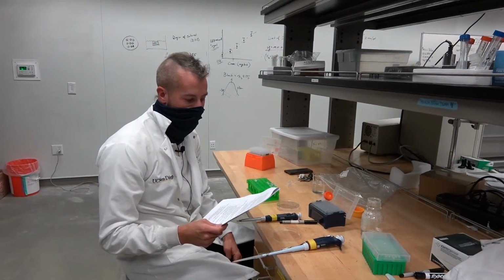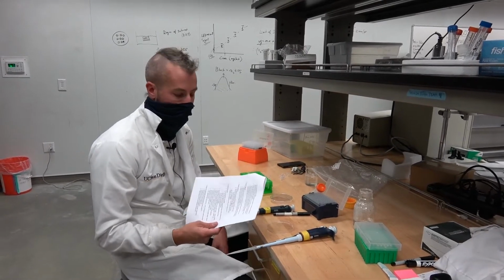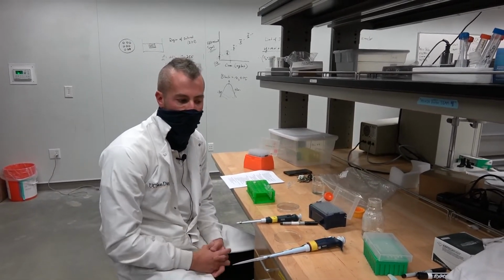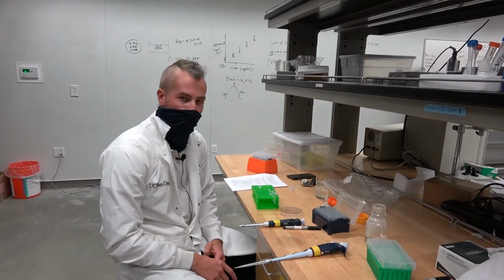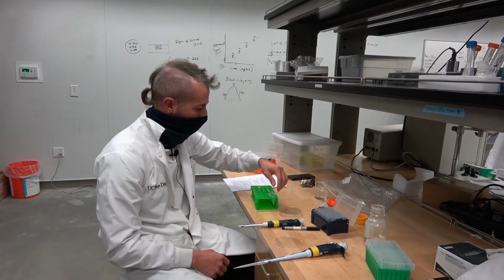So I'm now on step 7D on the protocol if you're following along, and we're going to make these different dilution factors like I talked about on the board. Again, like I said, the exact volume is not particularly as important as the dilution ratio. So I know that I'm going to need about 200 microliters, so I'm going to make at least 200 microliters.